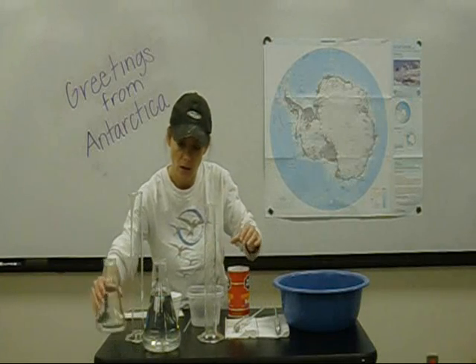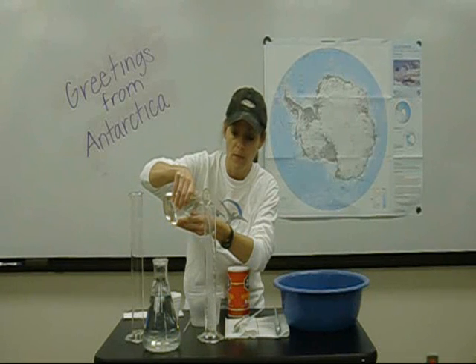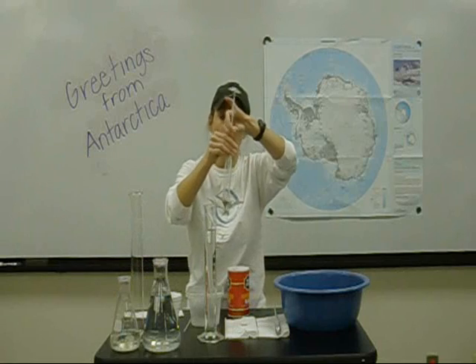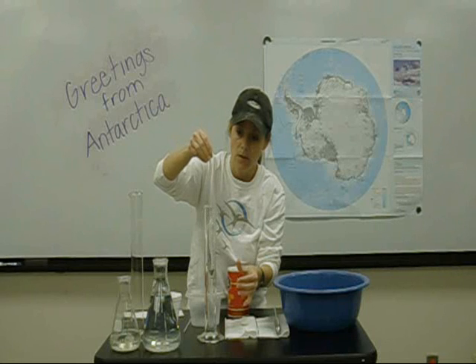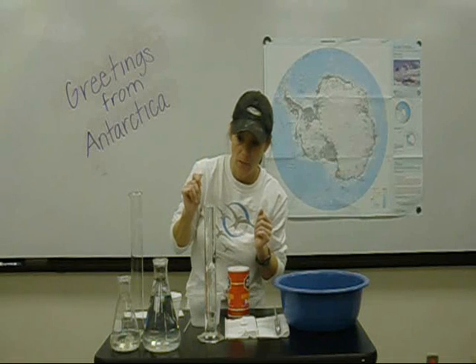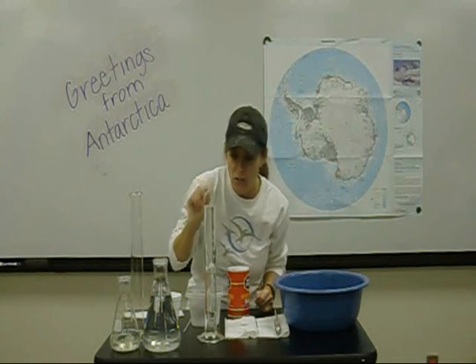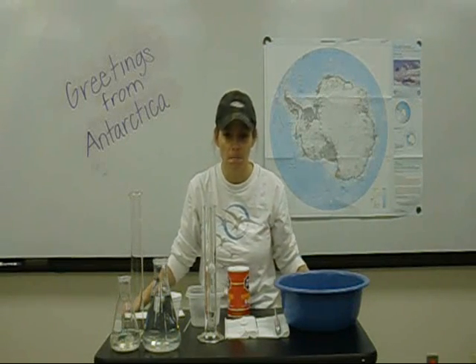So here's my tube. Let's go ahead and pour the tap water in there. I just poured it. Let's take my hydrometer and gently put it in there so it doesn't drop. Let it go. And it's facing me. You guys probably can't see that, but it is 1.000. It's maybe just a hair over that. So it's just a hair over 1.0.